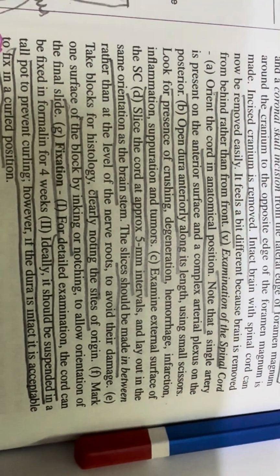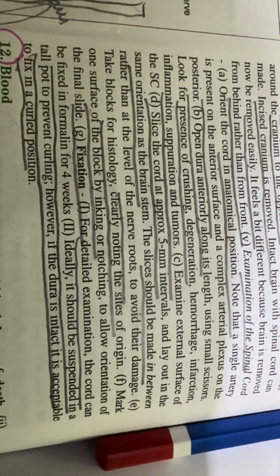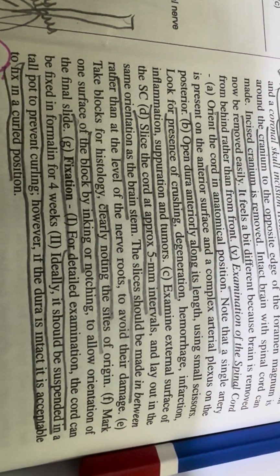Fixation. For detailed examination, the cord can be fixed in formalin for 4 weeks. Ideally, it should be suspended in a tall pot to prevent curling. However, if the dura is intact, it is acceptable to fix in a curled position.